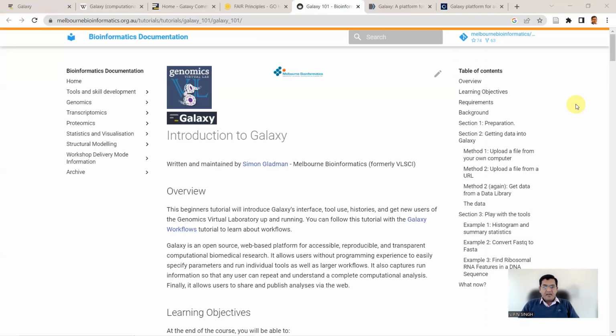However, one important thing is that programming is not everybody's cup of tea, and it also takes some time to acquire the skills of programming. Not every biologist is trained to write code, and therefore you may not have enough time. Some of you may be in your PhD final year or third year or beyond the second year, and you may not have enough time to start learning coding and then implement it for data analysis. So for such users, there is still hope, and that hope is in the form of the workflows that are available to you. One such common workflow is Galaxy.